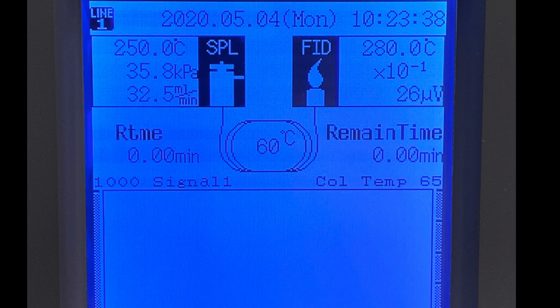The detector, or flame ionization detector — FID in this case — temperature is 280 degrees Celsius. The carrier gas flow rate is shown here to be 32.5 milliliters per minute. All of these variables will affect the retention time, or the time it takes the sample to elute from the column.